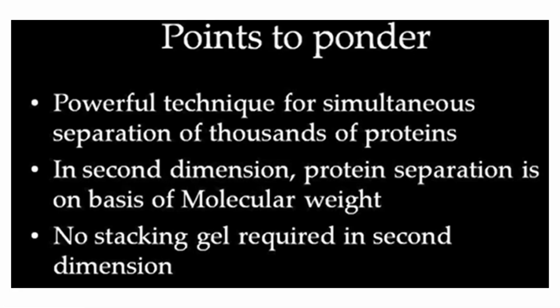So more majorly this lecture was practical, where a few lab members have shown you all how exactly this technique is performed. So I can go through the specific practicalities of this first dimension and second dimension separation.